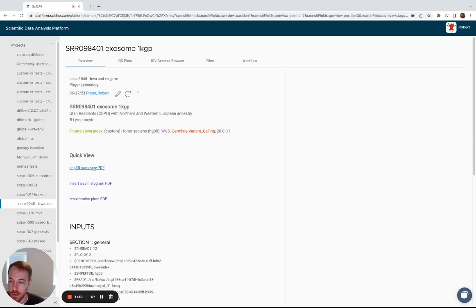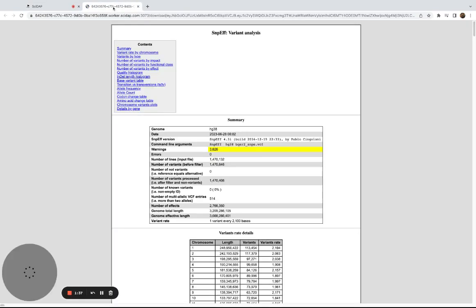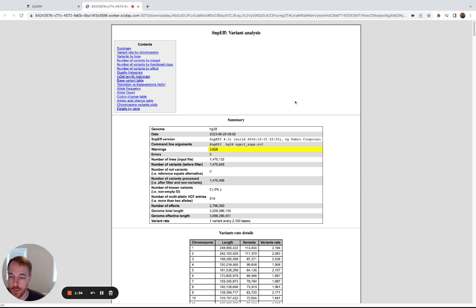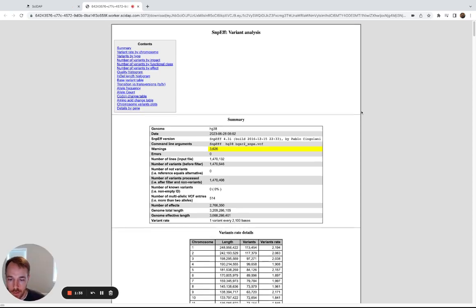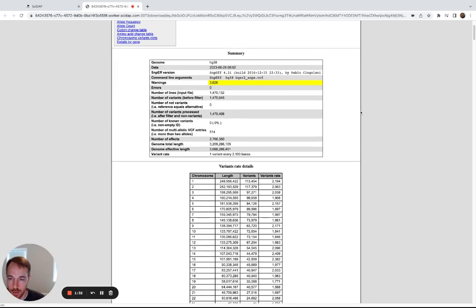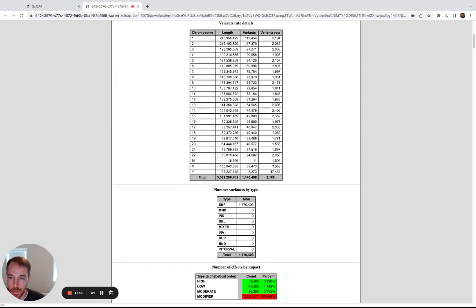And then the third is a summary for the SNPF program, which again predicts the effects of the SNPs that were found in your sample. It has lots of different summary tables.